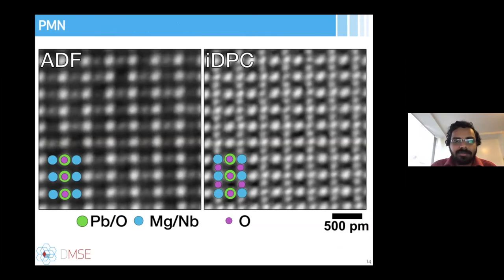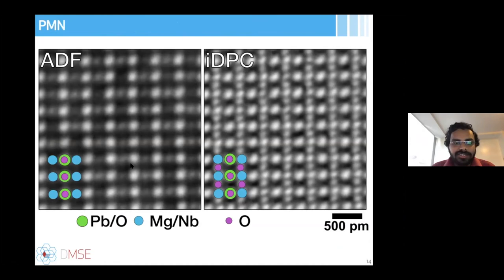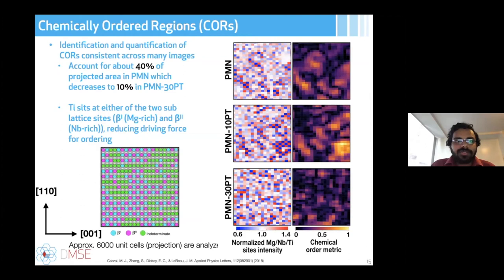We performed aberration-corrected electron microscopy imaging on the PMN system. Here are ADF and IDPC images: the ADF image shows Z-contrast, with visible contrast changes at the B-site (the magnesium and niobium side), but no contrast from oxygen atoms. The IDPC image shows clear oxygen contrast, so we can get information about all cations from ADF and about both anions and cations from IDPC simultaneously.